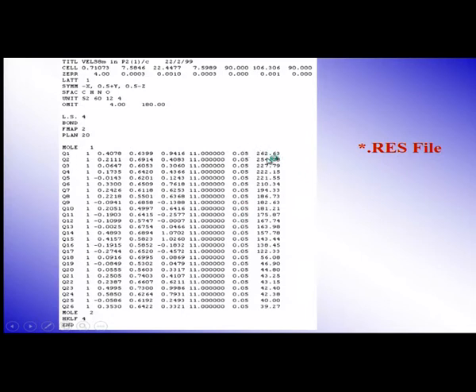Now, if you look at the last column, here the species are carbon, nitrogen, oxygen only. The difference is only 1 electron, 1 atomic number. You see here, gradually, slowly the peak heights decrease. When it goes from 17 to 122, suddenly it goes to a double digit 56 only, which means some strange thing is there, which means you got the structure up to whatever atoms you need, everything is proper, behaving properly. These are called spurious peaks. We can delete these peaks.